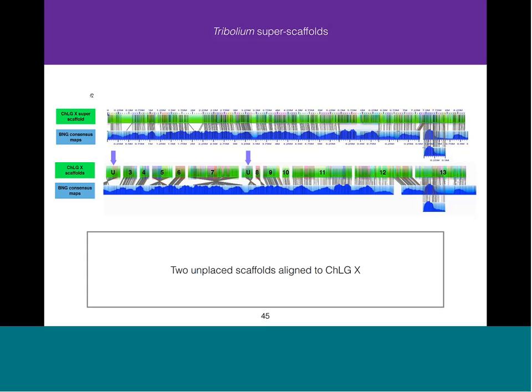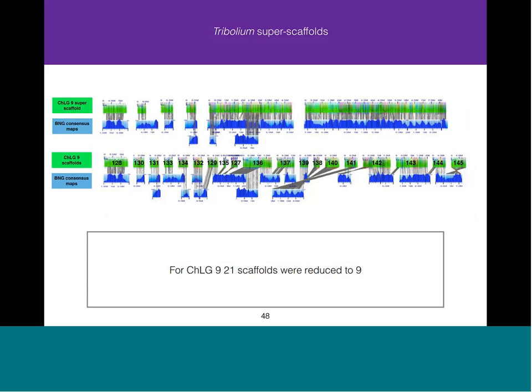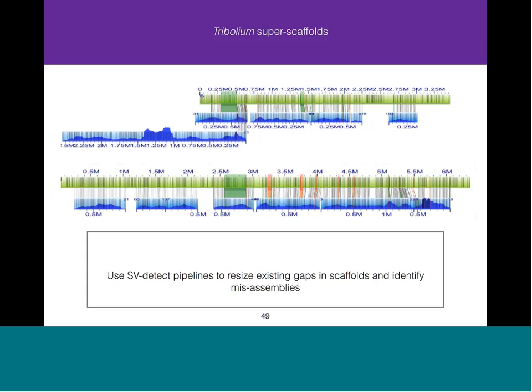So we played around with trying to use contigs for projects and trying to use scaffolds for projects, with breaking scaffolds and feeding those back in. And what we found was that we got the best results using scaffolds, including their ends, and we ultimately want to use the structural variant detection to go in and internally break and resize gaps that are within scaffolds.